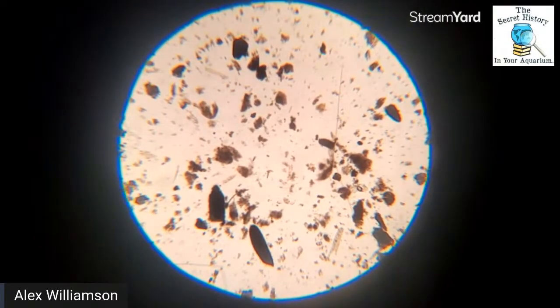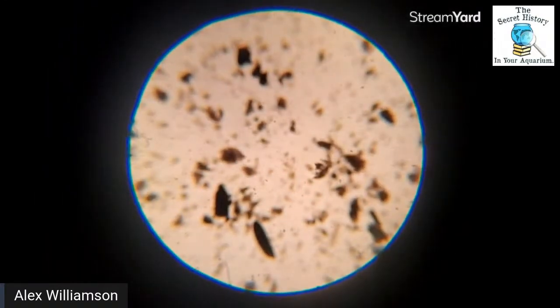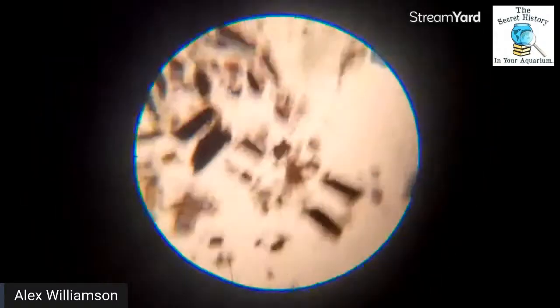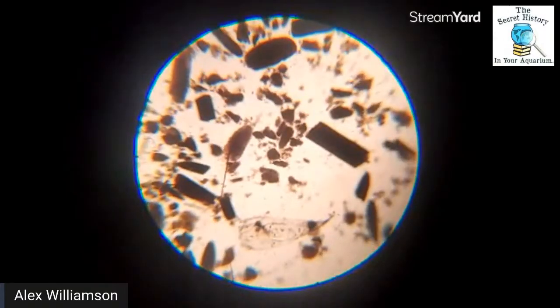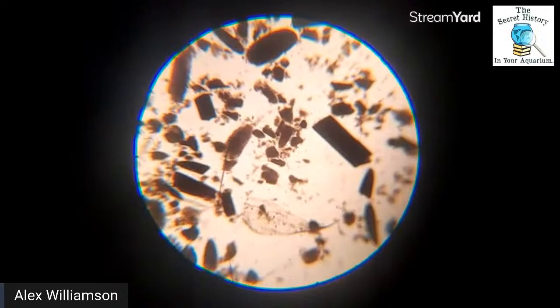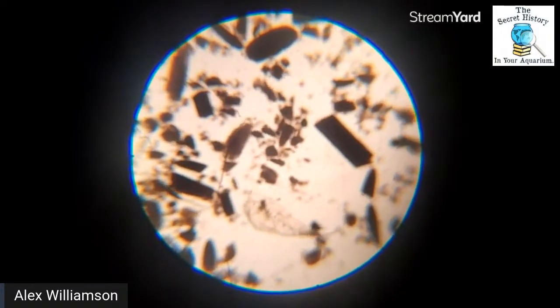What is living in there? Anything? Oh, yeah, I'm sure we've got some things. Oh, I see some little whirligigs. Let's zoom around a little bit. Let's look at this deeper puddle I put on here. There we go. There's a stentor. Look at that bad boy right there. Hanging out. Dead center is the stentor.